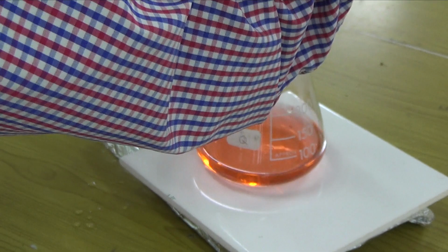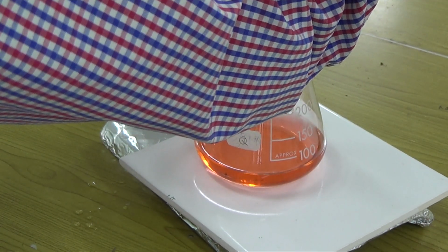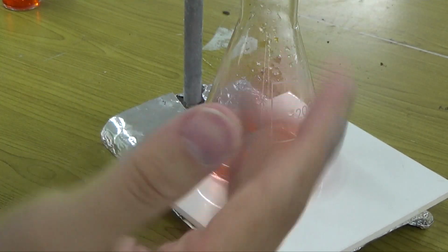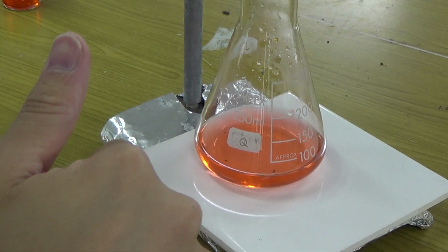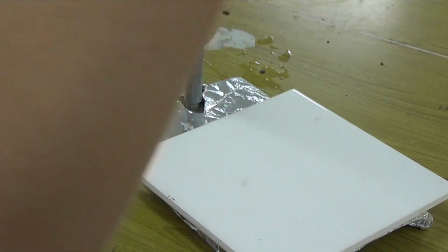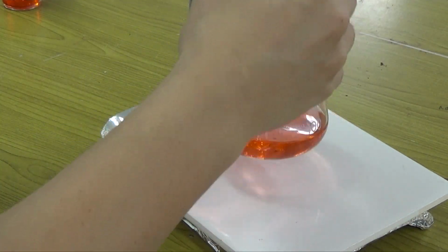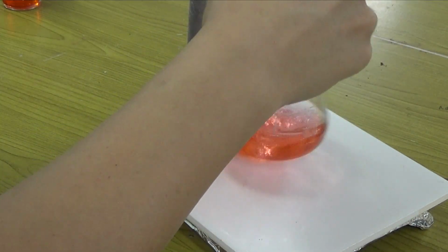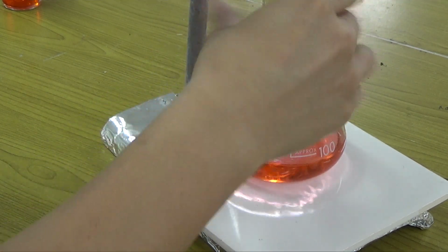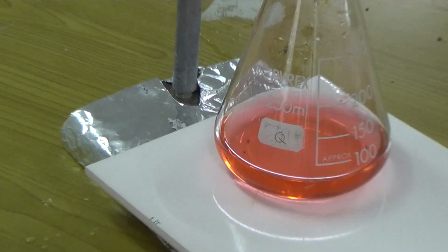Just now was 3.0, now it is 26.7 minus 3.0, so that is 23.7. 23.7 should be in excess already. 23.7 is in excess. I'm just going to add a lot more and see what happens. Yeah, there's no more color change. That was definitely in excess. So 23.7 cm3 was definitely in excess.